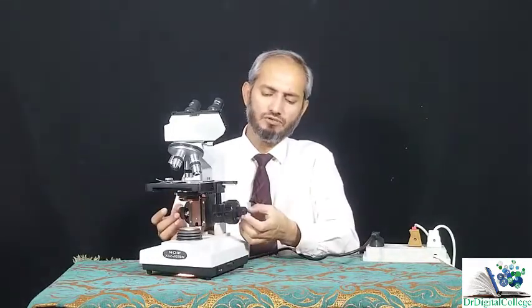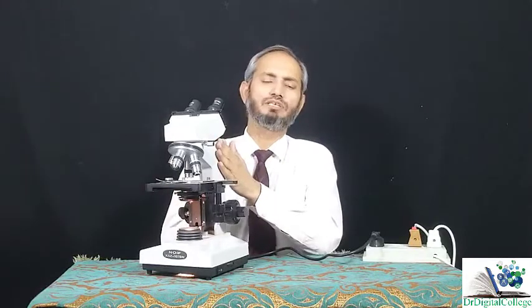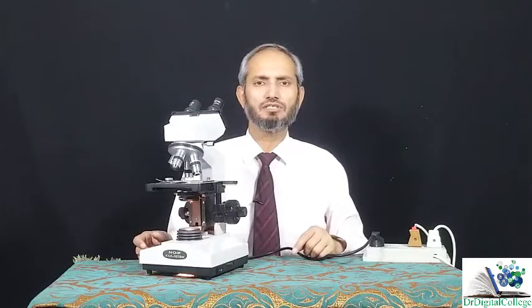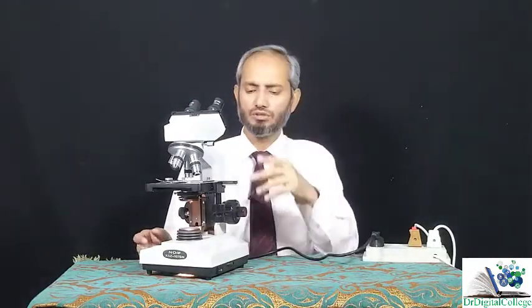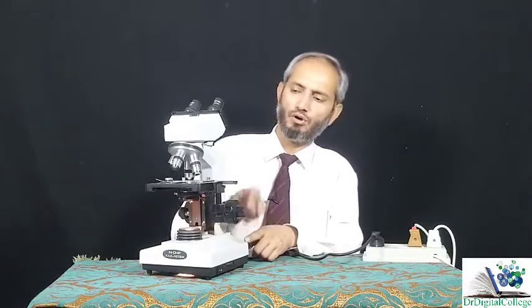One thing more is that some people have different eyesight than other people, so you will have to change the fine focus. For more clarity of the image, you will adjust your fine focus. If the same microscope is being used by two people, as is done in the British Council examination, where one microscope is shared by two candidates, the two candidates may have different eyesights, so you will adjust your fine focusing with this smaller knob.